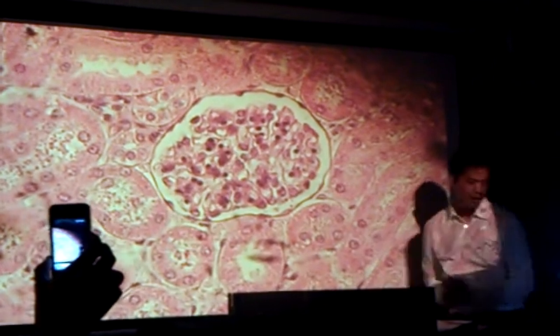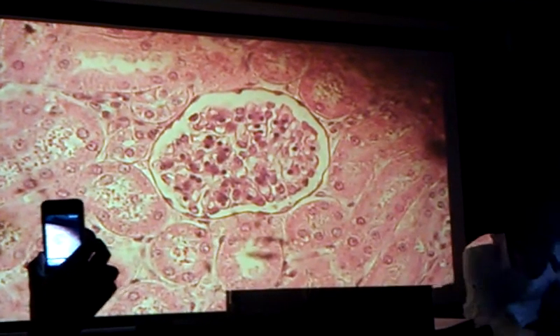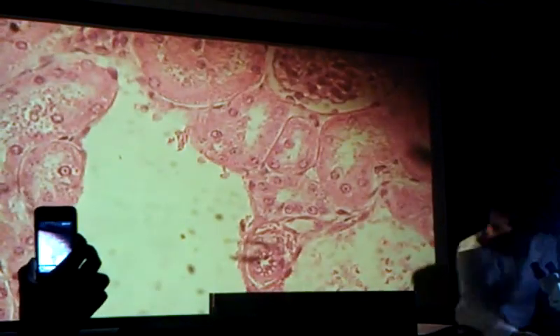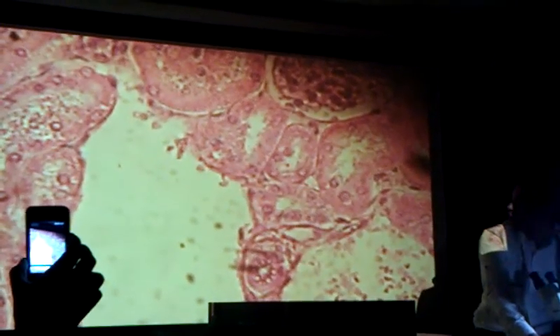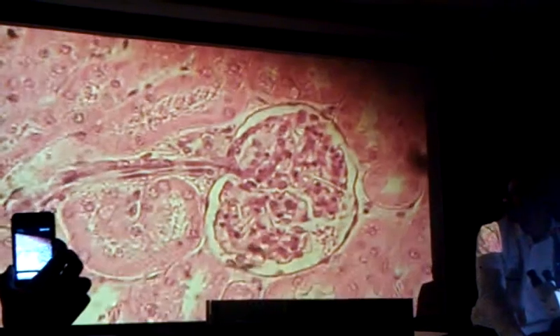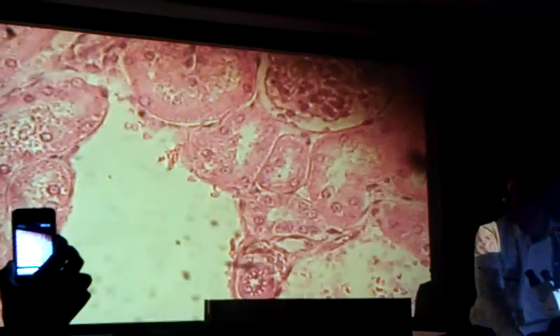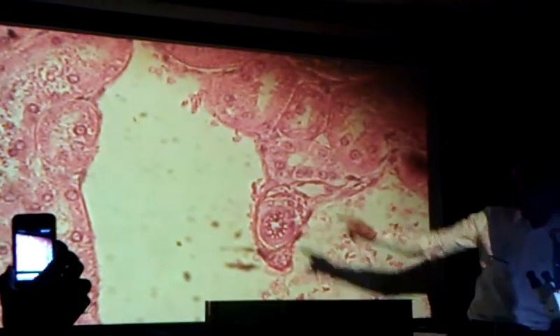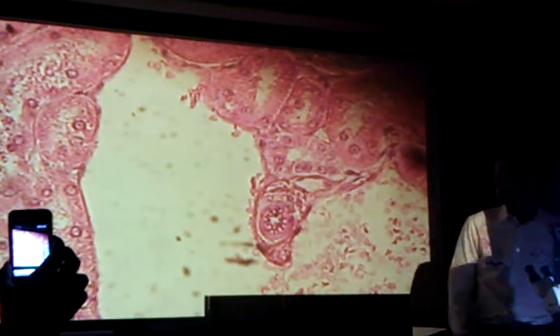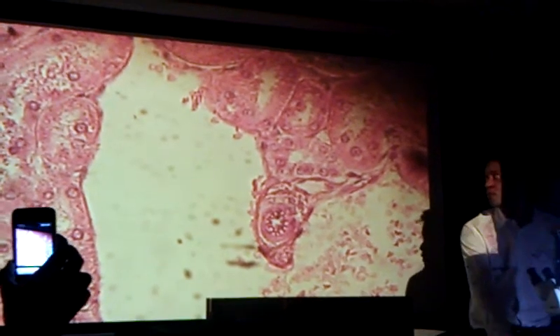He wants you to identify also maybe a collecting duct. I'll give you my best guess of what a collecting duct looks like. See that large space right there? Here's your glomerulus here — this large space might be a collecting duct. So if you see a large space in the kidney, that's probably your collecting duct.